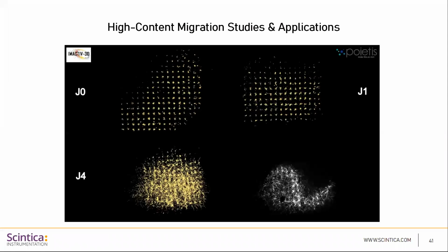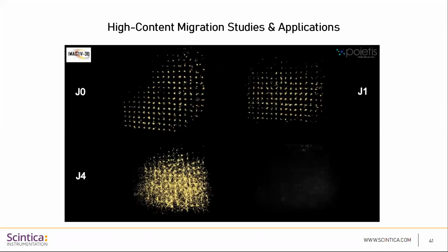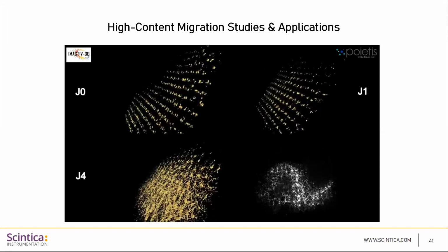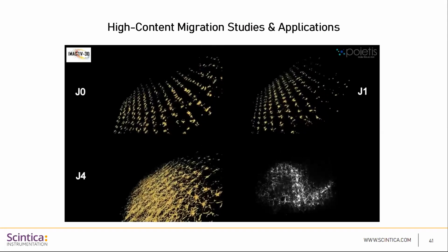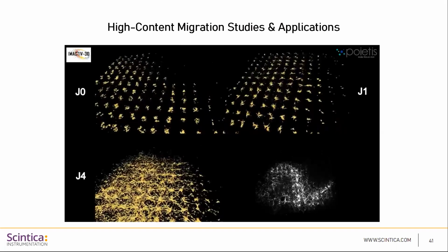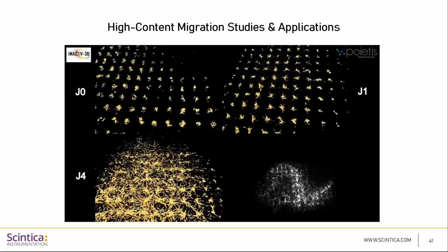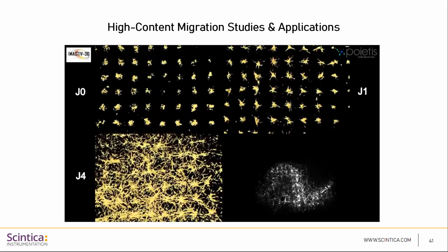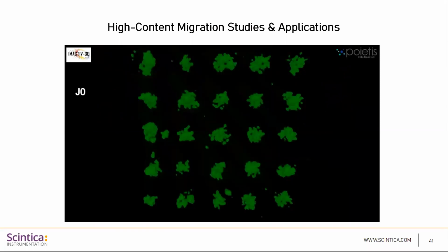However, I wanted to show you the kind of data you can generate by coupling bioprinting manufacturing with proper 3D analysis, like light sheet imaging. You can appreciate here cell migration over time in a 3D matrix. What we look at here is fibroblast migration inside the collagen matrix over time, and we can precisely track pattern evolution and cell migration from day 0 to day 5 after printing.